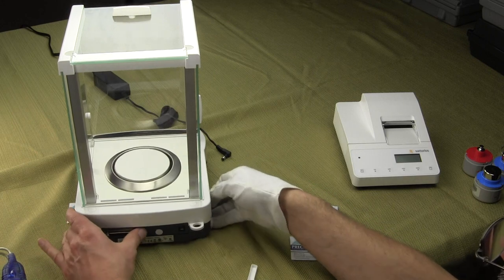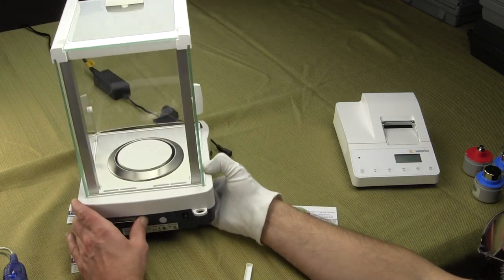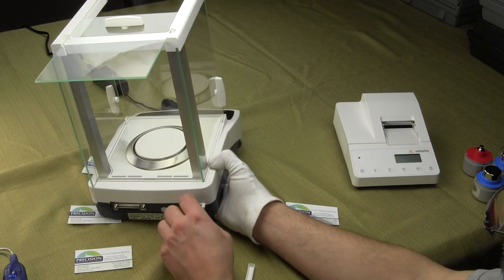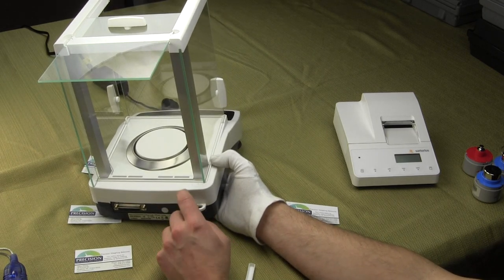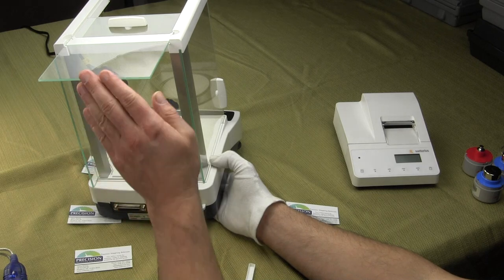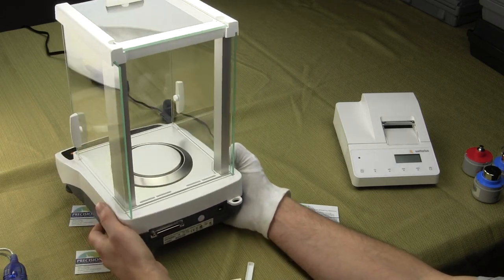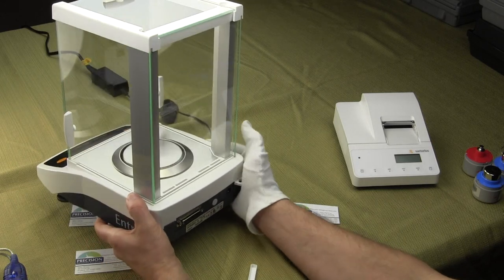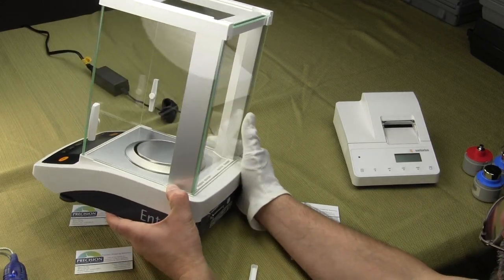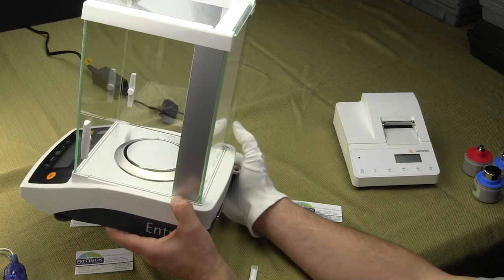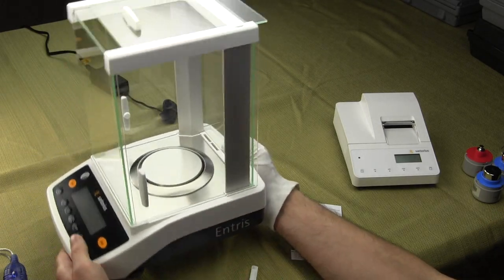On the rear of the balance, there's a security hub where you can put a cable through it if you want to lock it down. A lot of universities do lock down their balances. On the bottom of the balance, you have two adjustable feet in the front. I don't want to flip it over because I don't want the weigh pan on the inside to fall out.